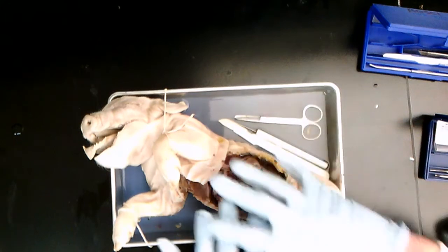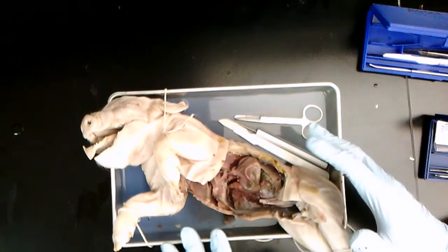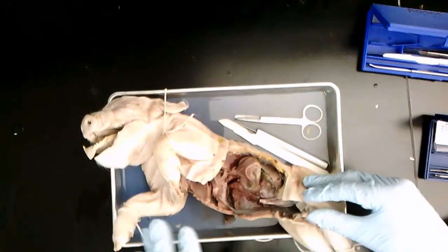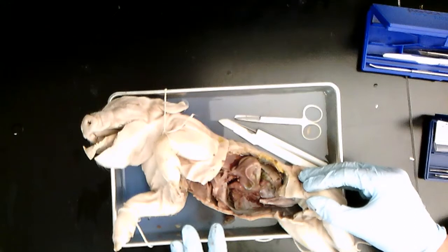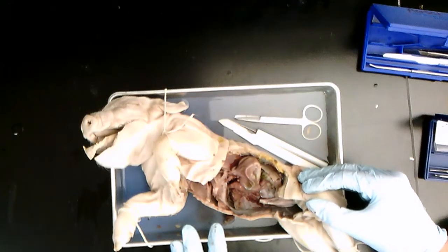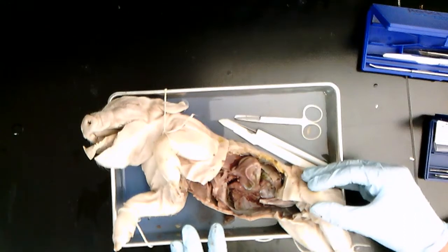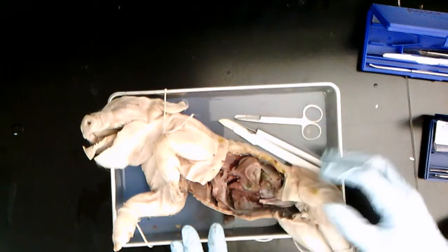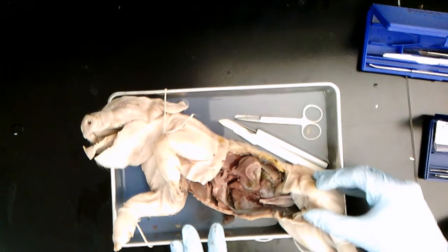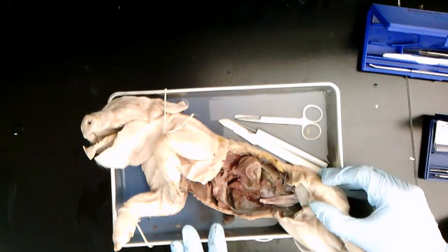You could do a day on muscle tissue and the veins. There's all sorts of things you can do with this. And Carolina Biological does sell a little book for $15 or $20 that goes through each system of the fetal pig. So there are activities that you can develop based off that material.